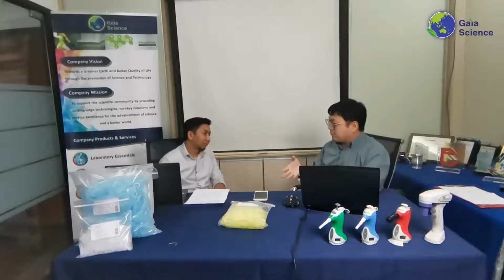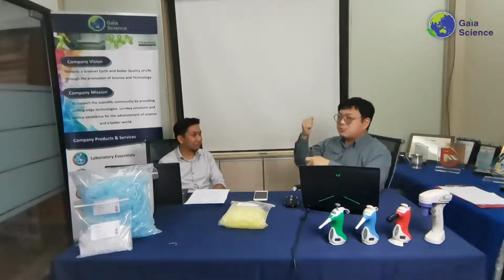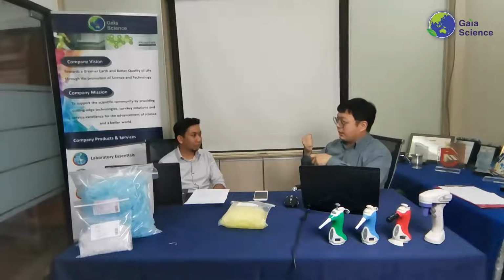So the best way is to get a small sample, request one if you can. They should provide you a small pack, which we do have, by the way, so contact us on that. Try and see whether it fits onto your pipette perfectly, not just whether it can fit, but also whether you can eject it correctly. Make sure it can also aspirate the exact amount that you normally work with.